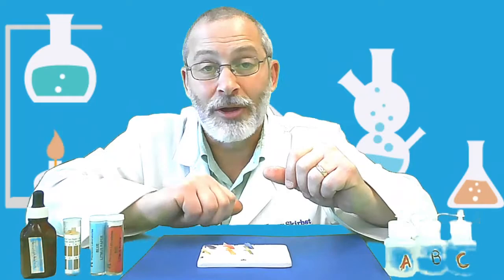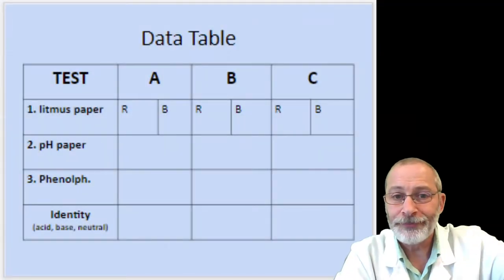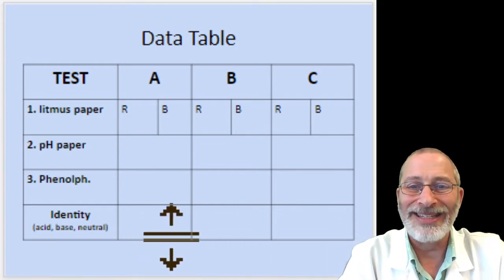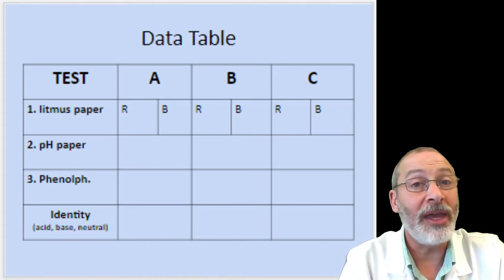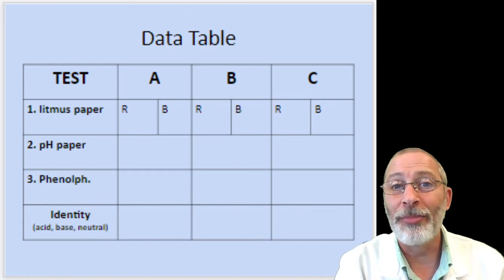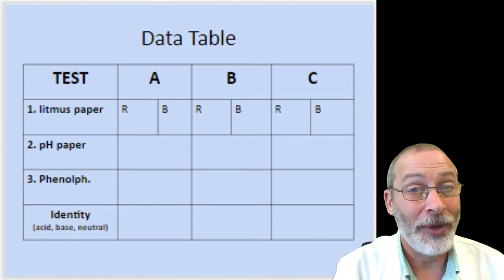Let me head back over here to our notes. So hopefully you have been able to identify each solution as either an acid, a base, or neutral. Write your conclusion, then we'll have an opportunity to discuss your findings and see how you made out.